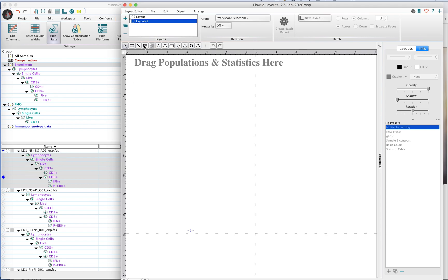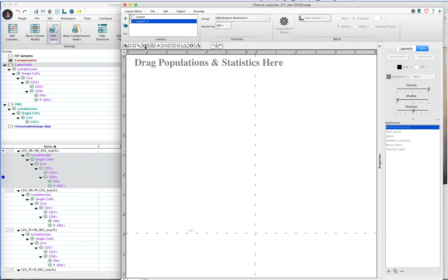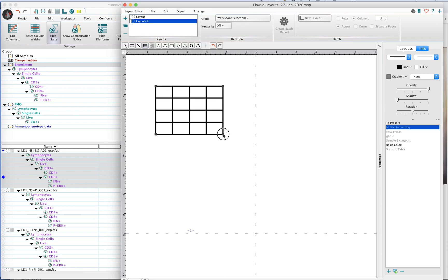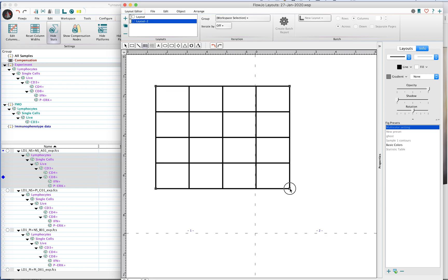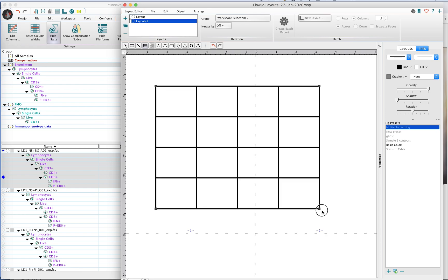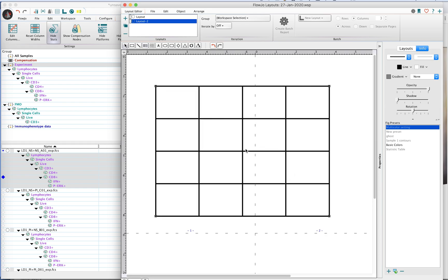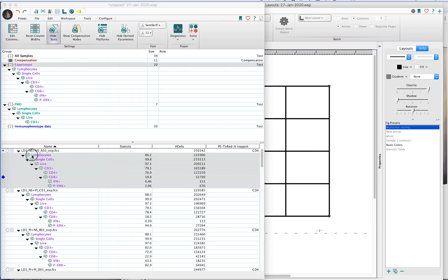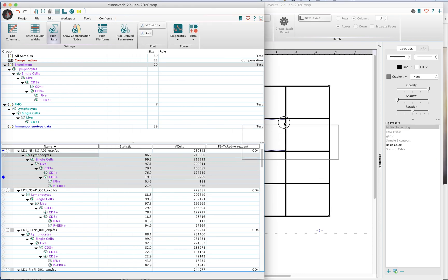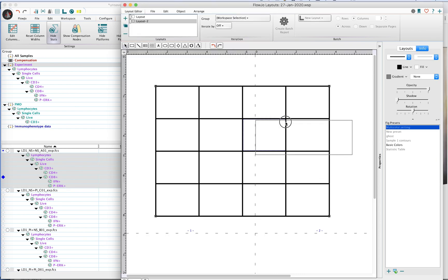There's another tool here called the grid tool. If you go ahead and select this and then click and drag in the layout editor itself, this will create a grid. From here you can simply drag and drop your populations onto the grid.